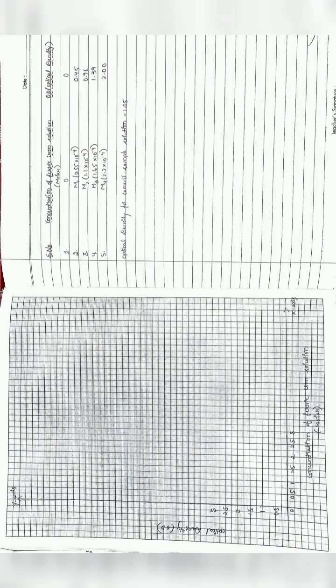Coming to how to plot the graph for the determination of percentage of iron in cement sample by colorimetry. On the right page you can see I already noted down the readings that I got.